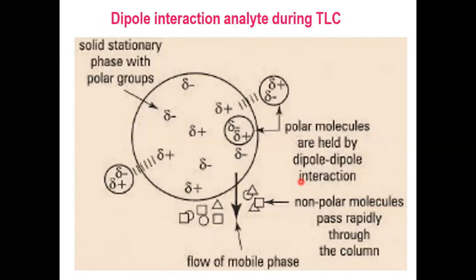This slide shows the dipole interaction of the analyte during chromatography. If the sample is a mixture of polar and non-polar molecules, polar molecules are held by the dipole-dipole interaction of the hydroxy groups of silica, whereas non-polar molecules pass rapidly through the column, or through the thin layer plate, with the flow of the mobile phase.